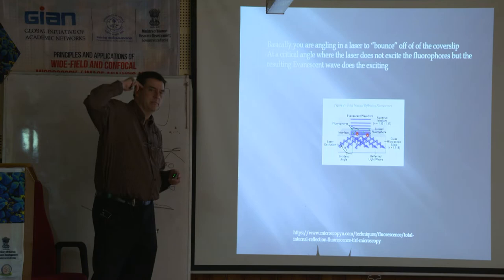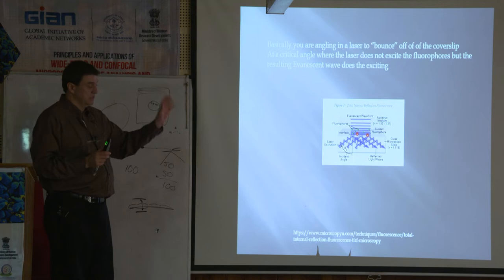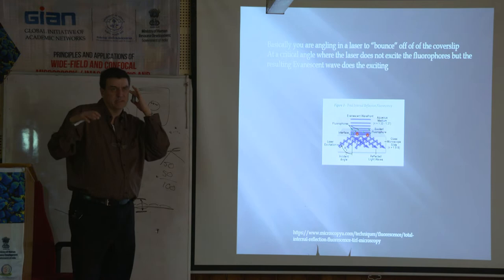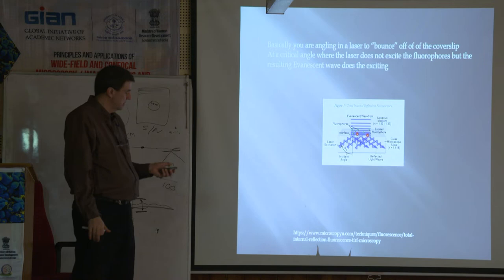So the signal is amazing versus the noise. There's almost no background. When you tune this angle just right, you're looking at a microscope, and it's like, bam, it just pops. It's really amazing to see. It's like when you go out at night where it's really, really dark, like where I live out in the country, we don't have many lights, and the stars are really, really bright. So when this works just right, it is like bright stars on a dark night. It's amazing how nice it is. So let's take a look at a couple images of that.